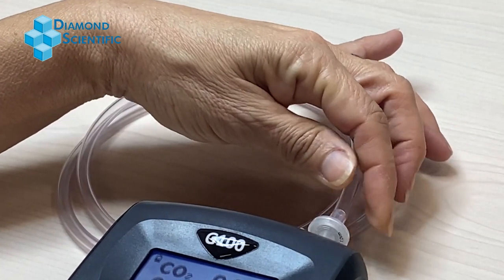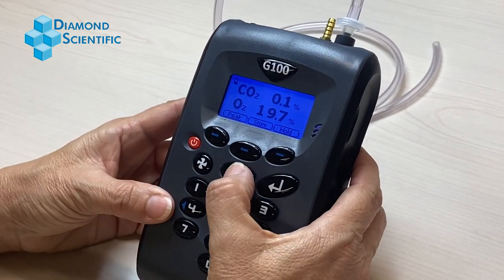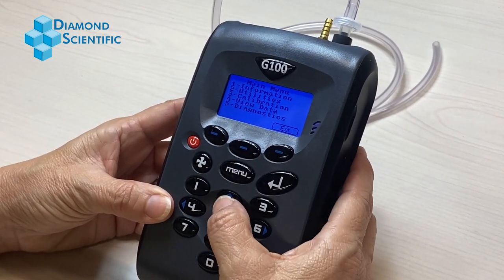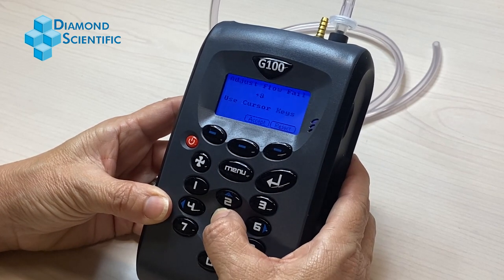If the instrument is still noting the flow failure message, press the menu button. Press 2 for utilities. Press 5 for flow fail.